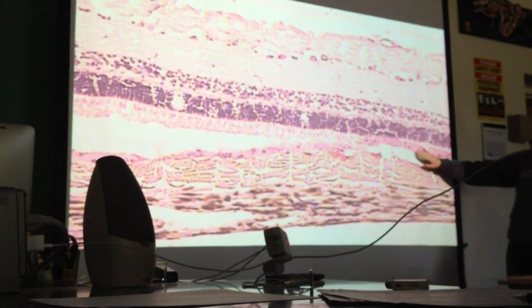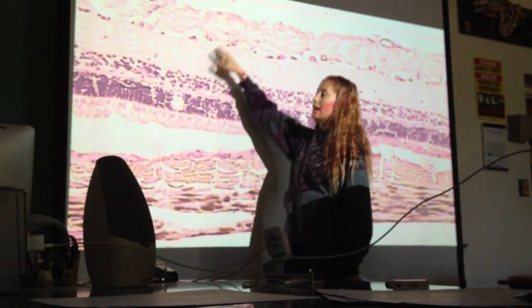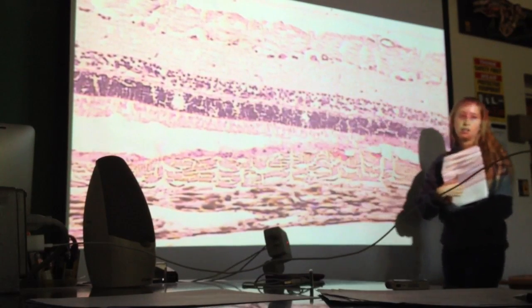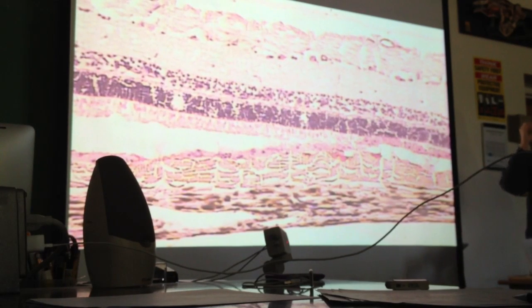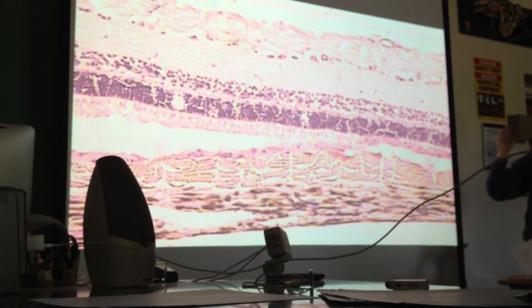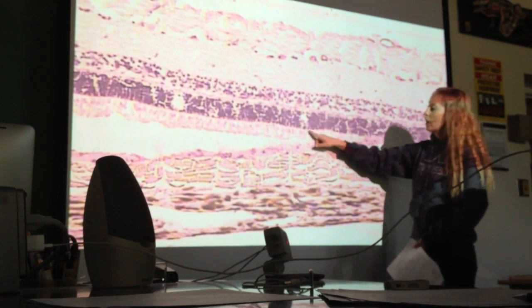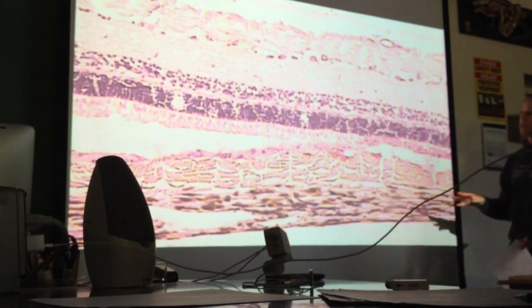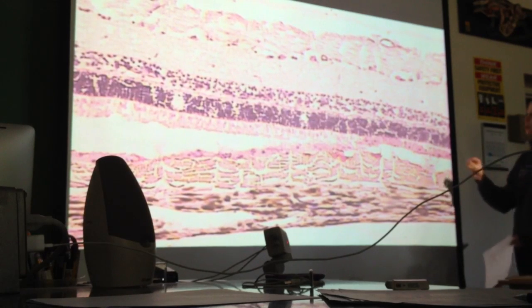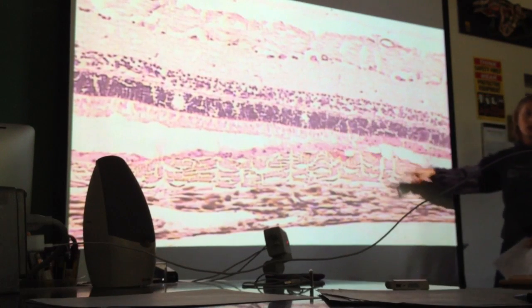And then we're going to start right here. I'm going to make this line so you can see it all the way through. Every single layer that we see belongs to an identification here, okay? Now, if you remember back to the very beginning, we were talking about neurons. Remember that they have a body with a nucleus, and then they have axons and dendrites, right? Well, in this, all of the dark purple that we see are all nuclei, and these lighter areas here will be those axons or dendrites, all right? So I'm pointing that out because one single layer is going to be composed of a dark patch of nuclei as well as a lighter patch, okay?